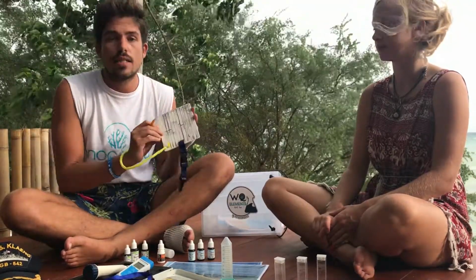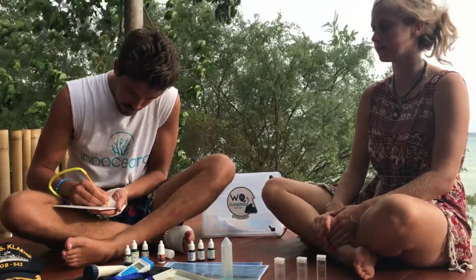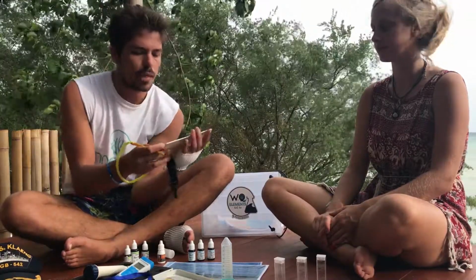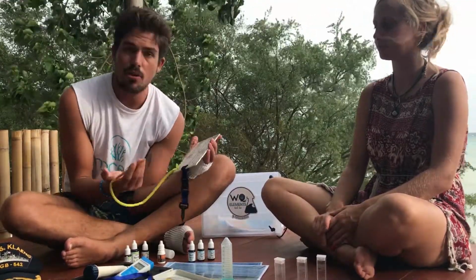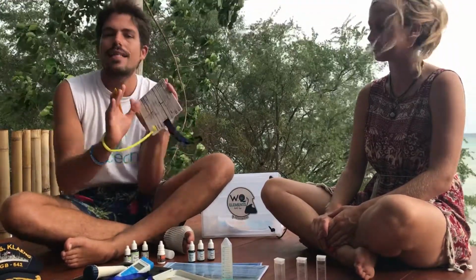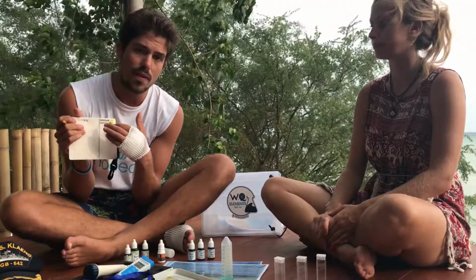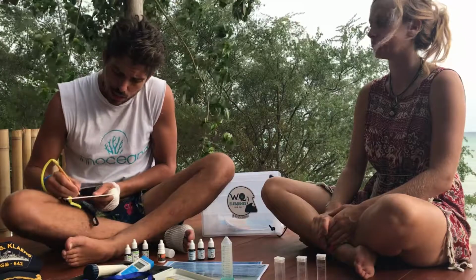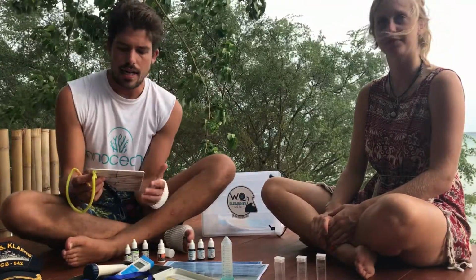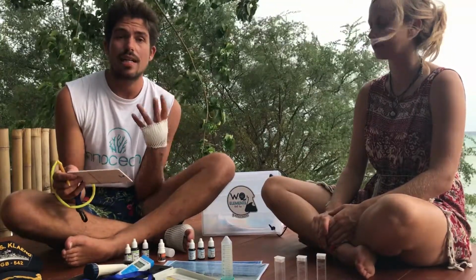And then there are two other things that you can optionally put, that is the site description, so I'm going to put source sampling. And the last one, I'm going to put the condition of the reef or the point of collection. I'm going to put just sand because it's on the shore. This is optional, and you can put whatever you want. On top of that, you can also put weather conditions. In this case, I'm going to put stormy because it's kind of stormy weather today. Okay, so this is all that you are going to collect before doing the actual data sampling.